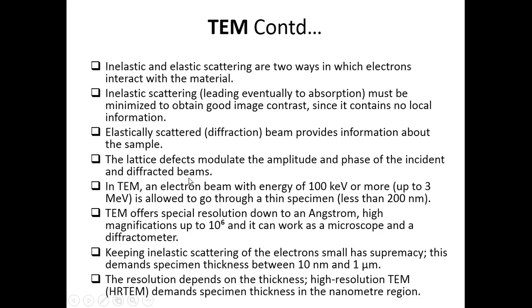Okay, the lattice defects modulate the amplitude and phase of the incident and diffracted beam. That is the main important thing. If there is a lattice defect in the crystal structure, of course, that will be modulated, and the amplitude and phase of the incident and diffracted beam will give the information with regard to those lattice defects.